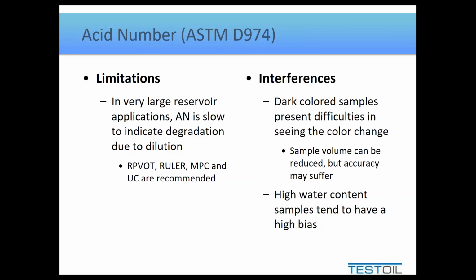If you do the test faster than normal and you achieve the same result that you did when you do it slowly, then the slow result must be the same. If you do it at 2 different speeds and the faster result is lower, it indicates that the test at the slower speed was dissociating acids while you were doing it, and therefore can be considered to be inaccurate.